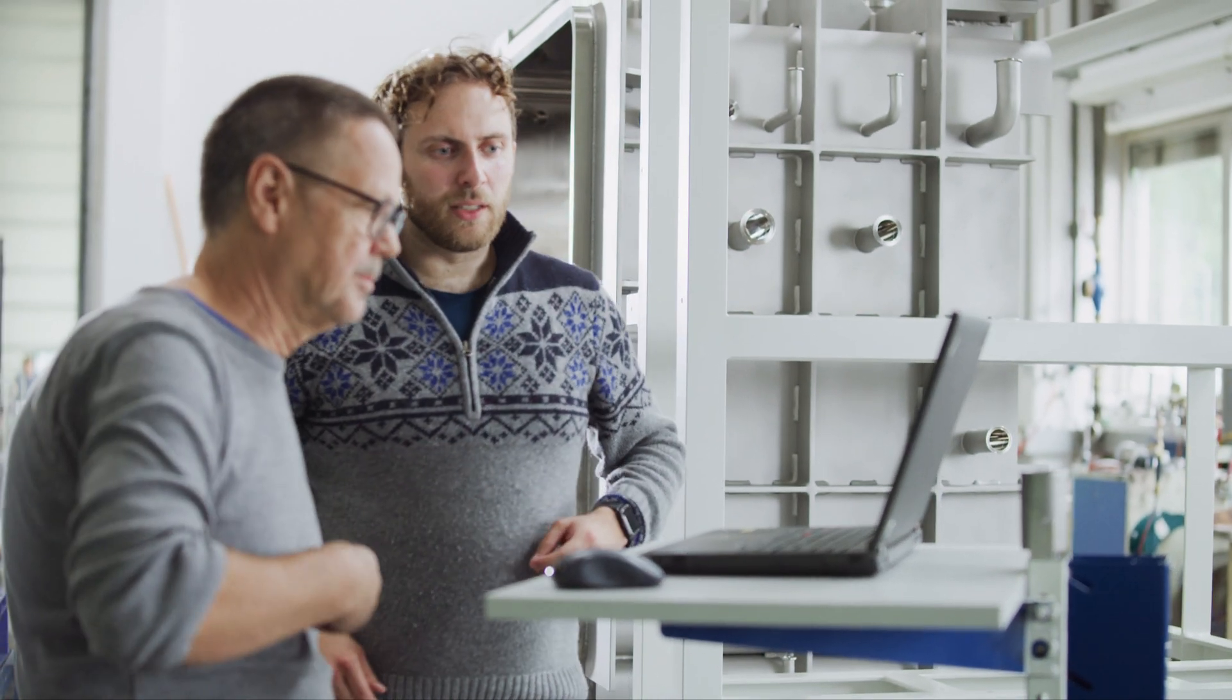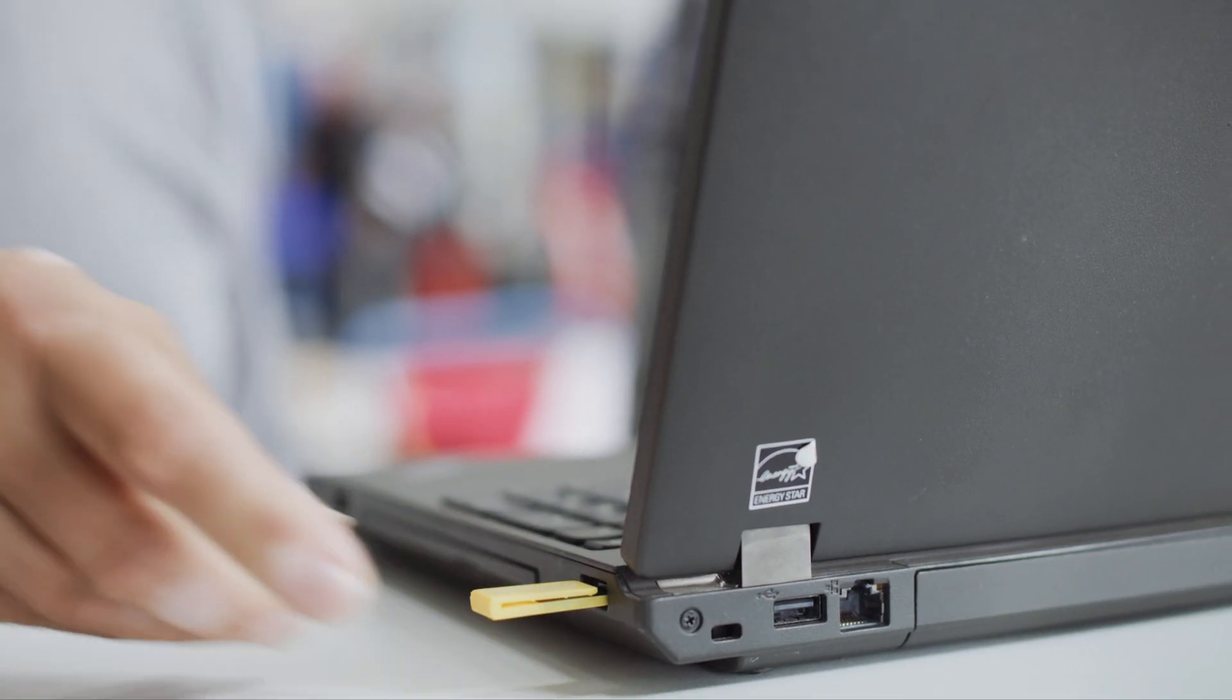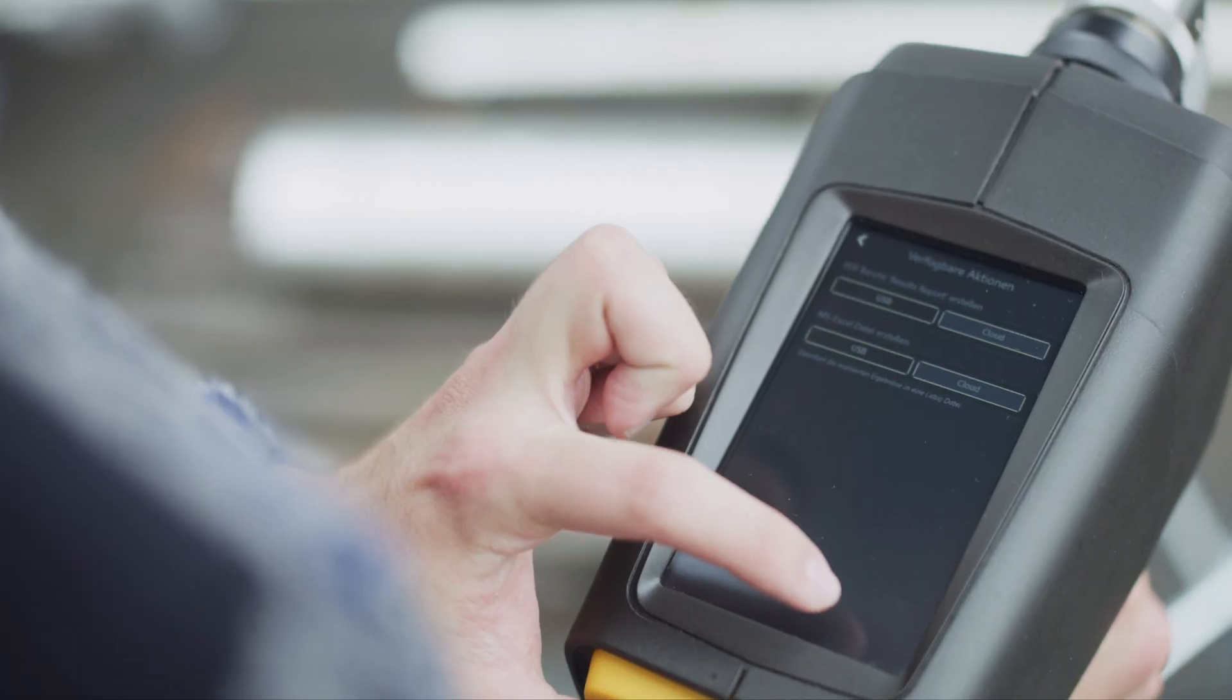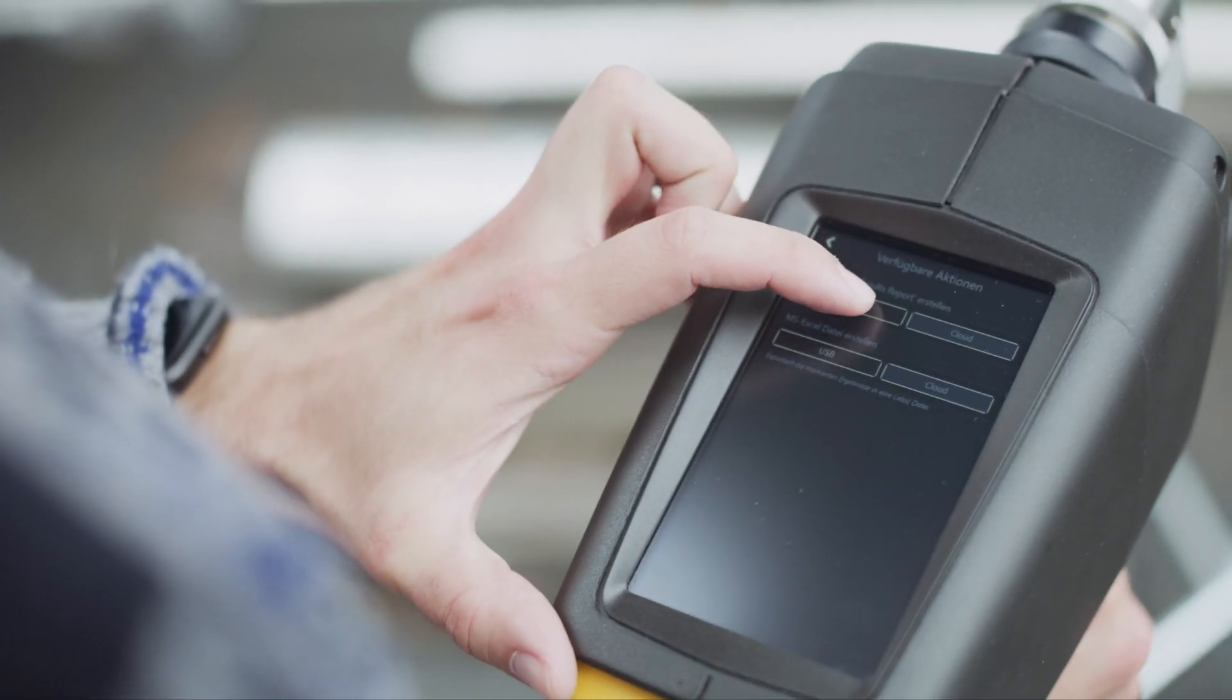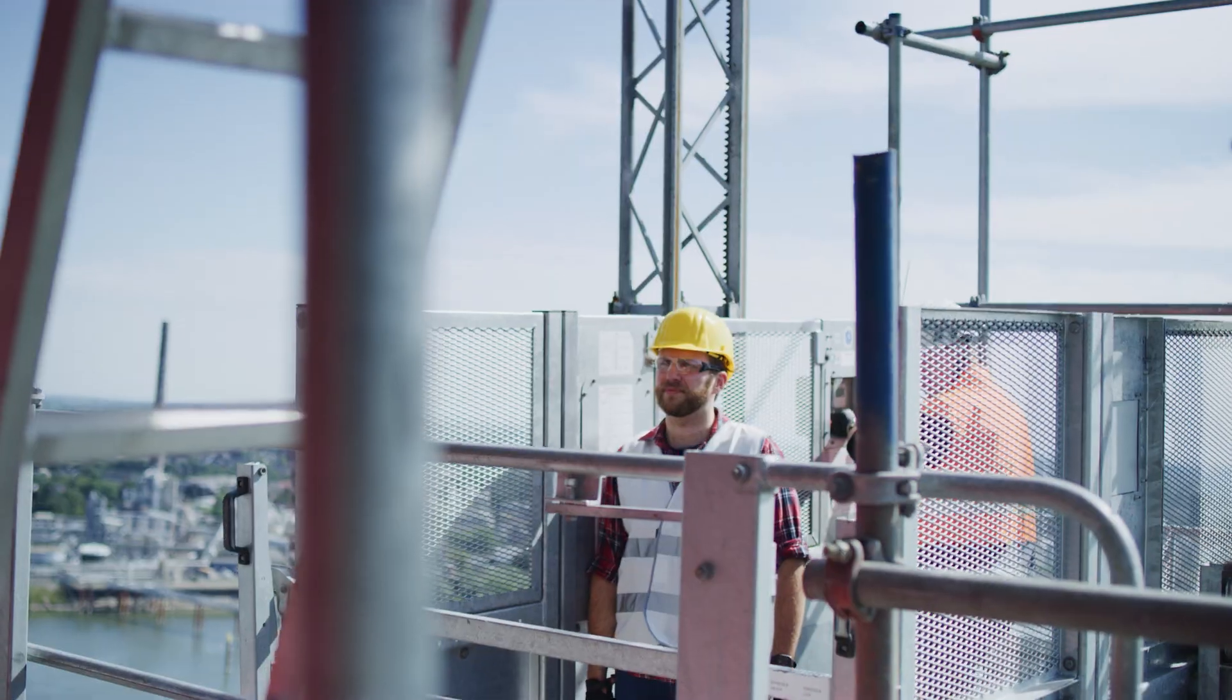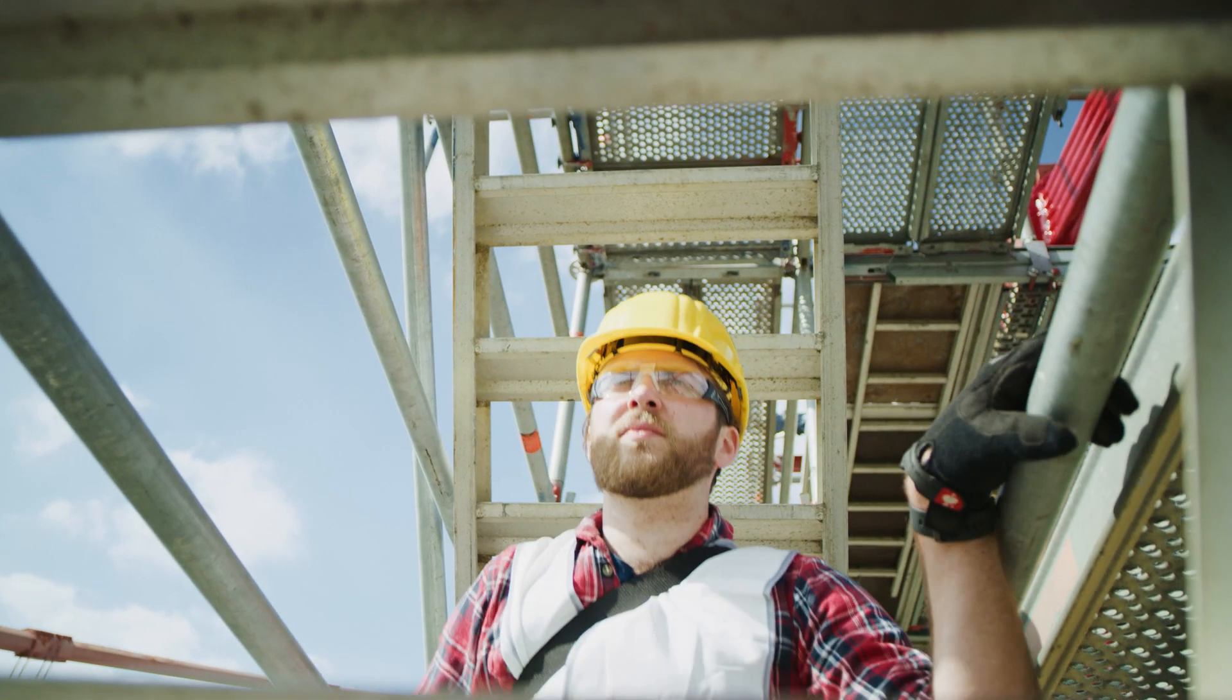All data is available at a glance on the instrument at all times, ensuring that reliability does not end with the measurement process. Reporting is done conveniently via touch operation, whether via USB stick or via cloud. This way, the data is immediately where needed.